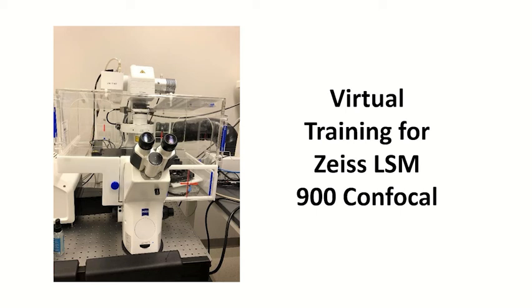This Zeiss LSM 900 confocal training is appropriate for anyone who is a high-level user on the Leica SP5 confocal and would like to learn how to use the Zeiss confocal, or is a current user of the Zeiss confocal and would like a refresher. In this video, you will learn how to operate the Zeiss LSM 900 confocal.